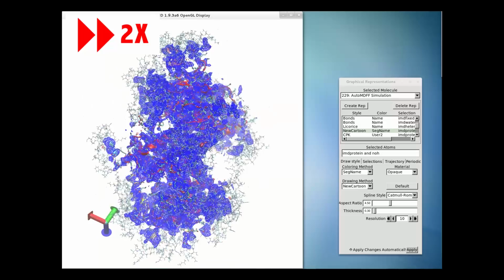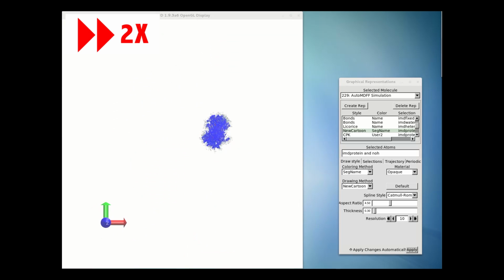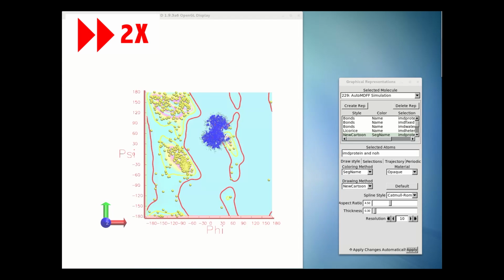as a new construct. To cut down on clutter, only those parts that are actually involved in simulations will be shown. We'll run another quick low temperature equilibration to settle into the new maps. Then it's time for the final detailed cleanups.